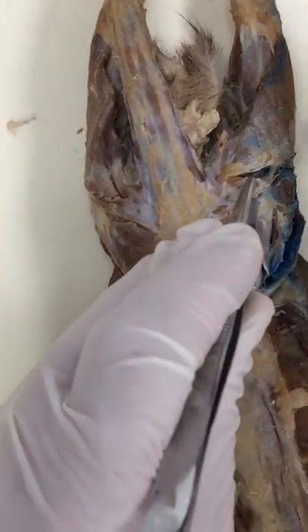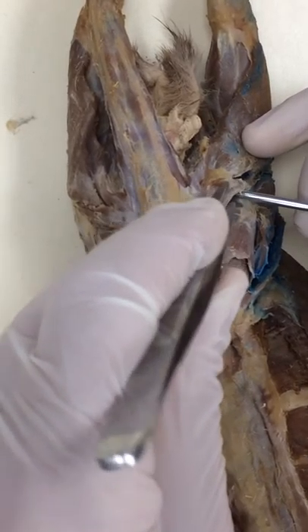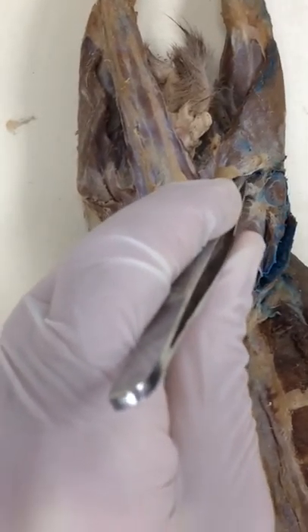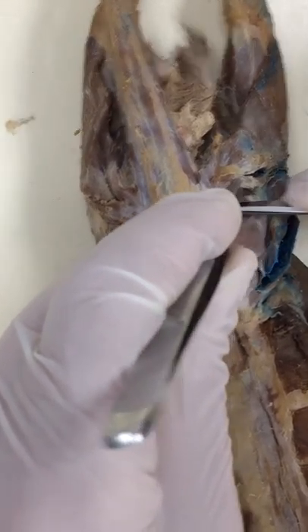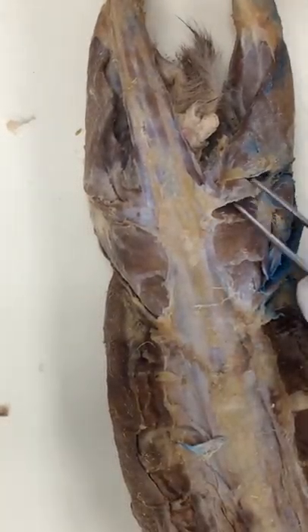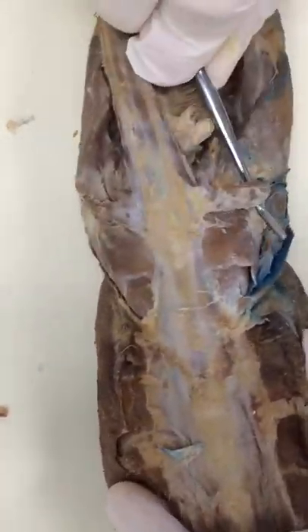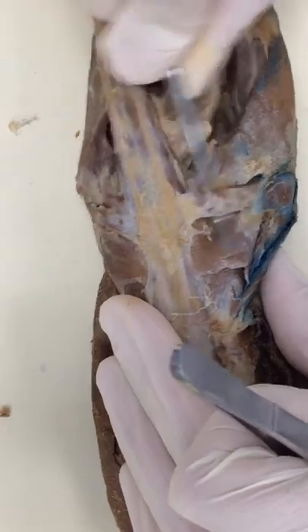Now I'm going to free it up on the front end. Push and pull, push and pull, push and pull. I should be able to get my probe right underneath there — just wiggle it back and forth. Caudo femoralis is done.